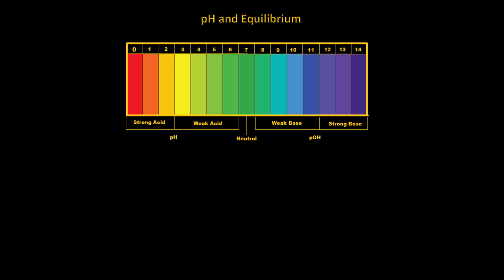This colorful graph is the pH graph of litmus paper showing the color formation of a litmus test. The pH graph starts at 0, and some graphs start at 1 and end at 14. There are times that it is possible to have a strength greater than or less than what the graph shows.